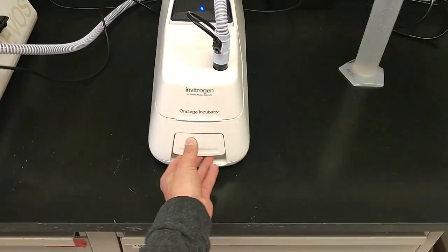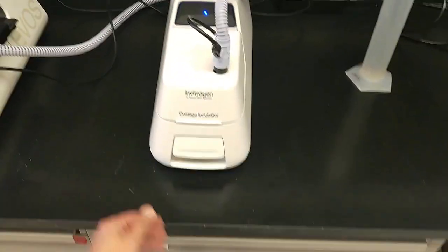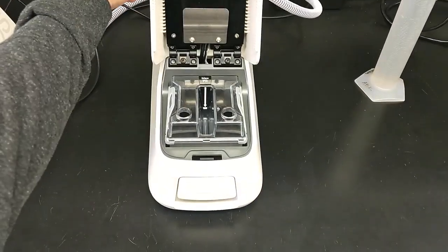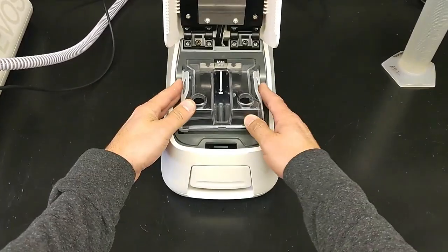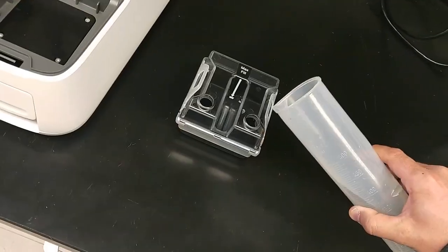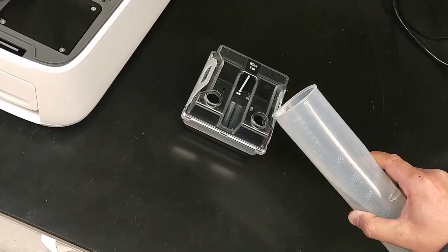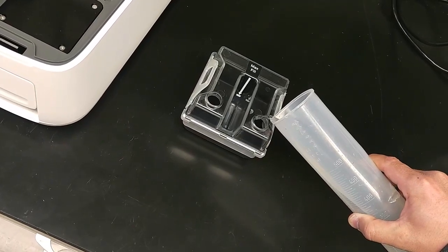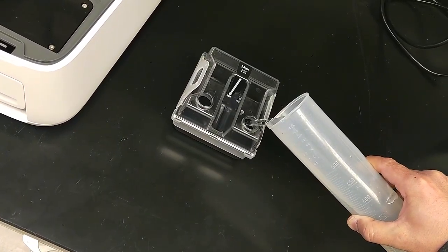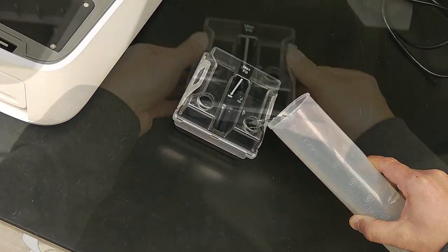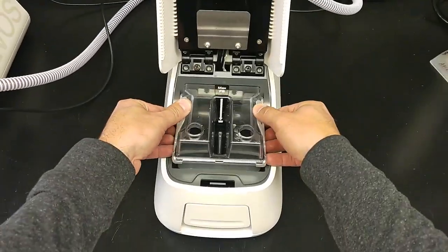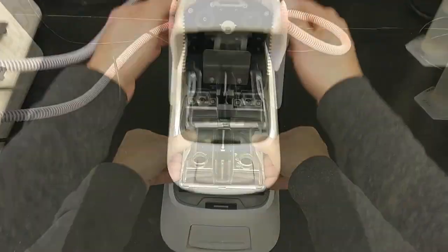Open the water reservoir door by pulling on the door release handle. Remove the water reservoir, add warm water approximately 50 degrees C to the max fill line through either fill hole. Replace the water reservoir and press the door closed.